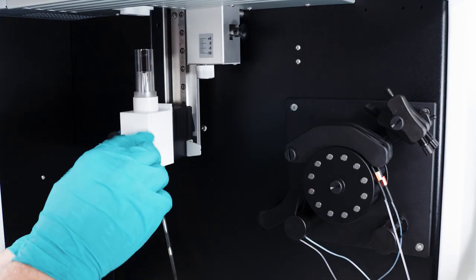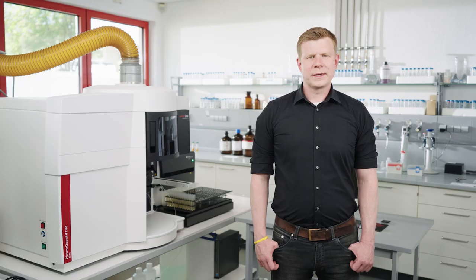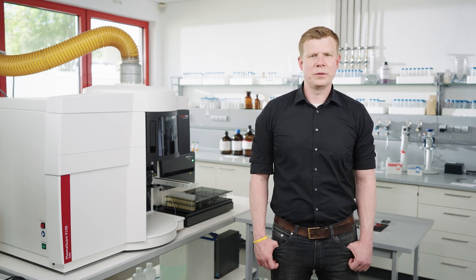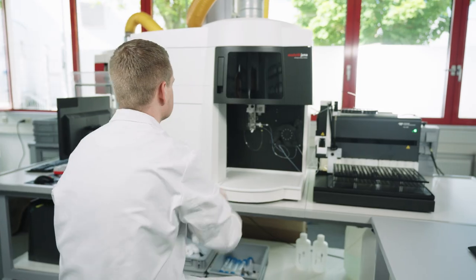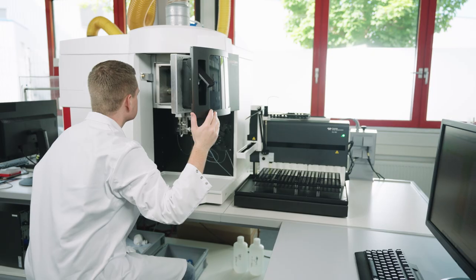Reassembly of the clean torch components is very simple, in reverse order to disassembly. In this way, the entire sample introduction system can be cleaned in a matter of minutes. Another set of components where matrix can be deposited over time are the windows in axial and radial plasma observation and the cone material. This leads to a gradual decrease of intensity. For cleaning, simply remove the windows and the cone and clean them according to the user instructions.